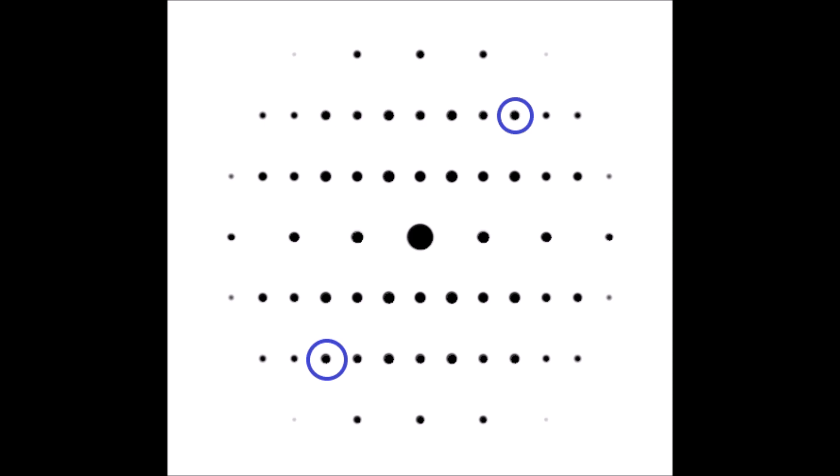So I can look at another pair of Bragg spots like you see here, and I see that yes, just like the first pair I considered, those are the same intensity. And I could do this with any other pair and I will find that they are the same intensity again.